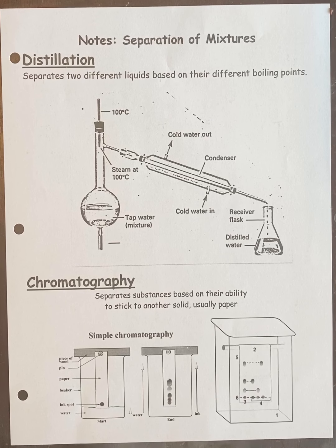Now, why do we do this? Again, it's cheap. This filter paper, you can buy hundreds of feet of it for a couple bucks. It only takes water and a glass tubing, and so this is a really easy, quick, and cheap tool to use. There are tools that would give you definitive answers, but that equipment, like for example high pressure liquid chromatography and things like that, is very expensive to run and operate. And so until you absolutely need a 100% definitive answer, you use the chromatography paper.